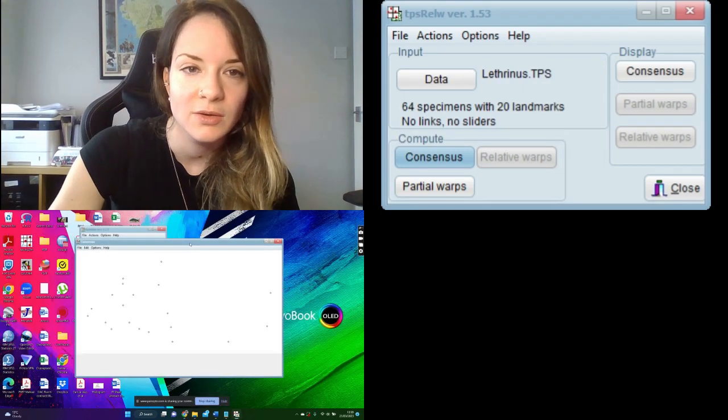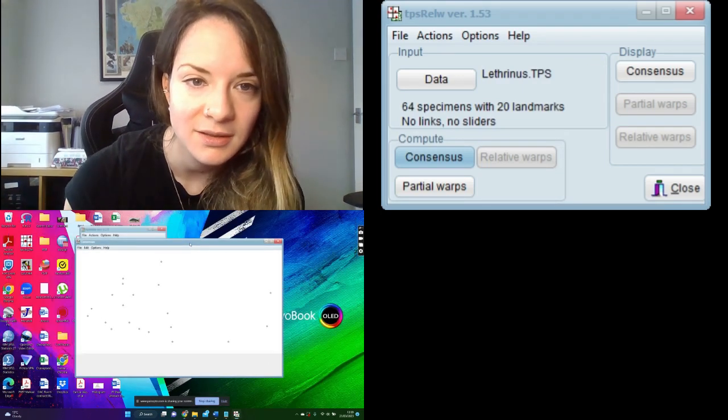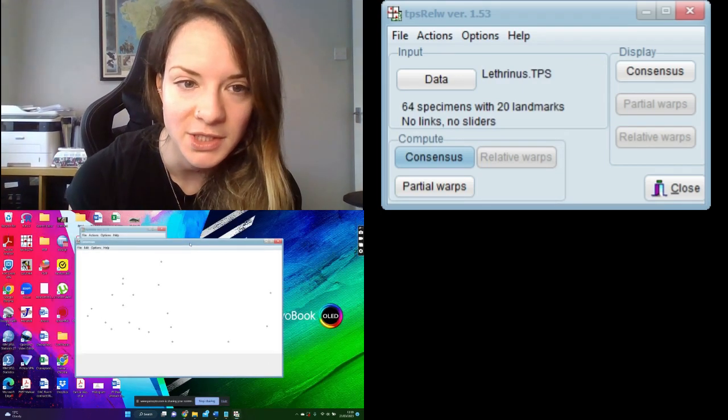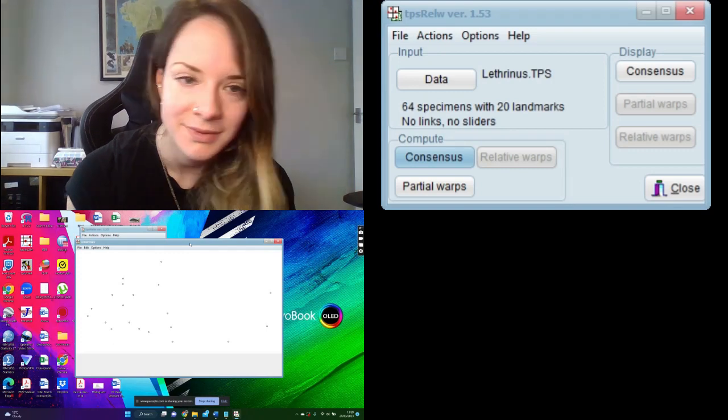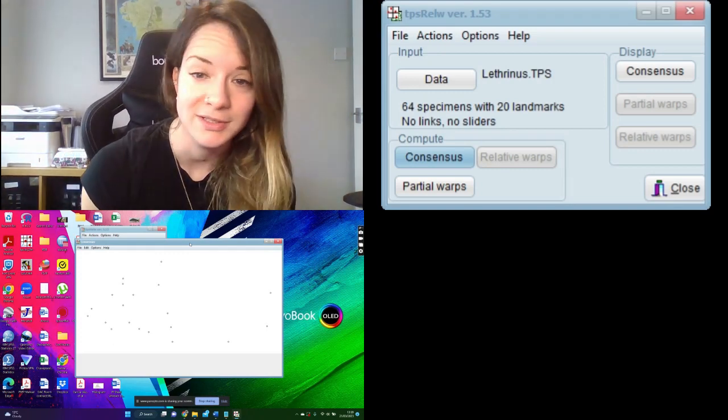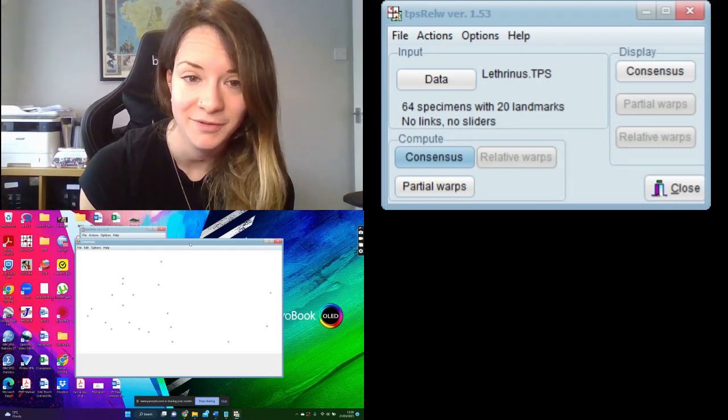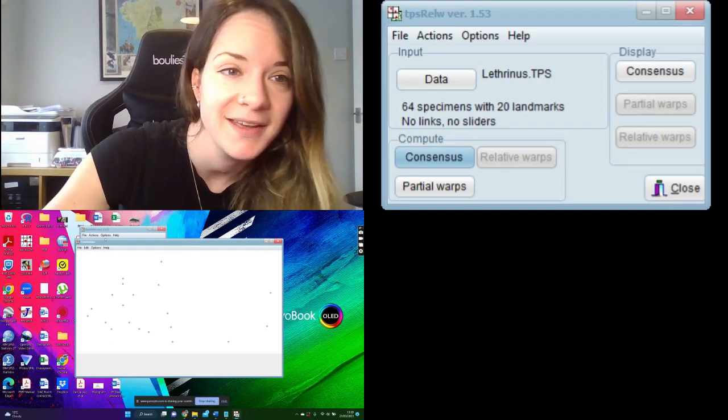So you can see it, our average shape. And as you can see, we're looking at a fish data set here.